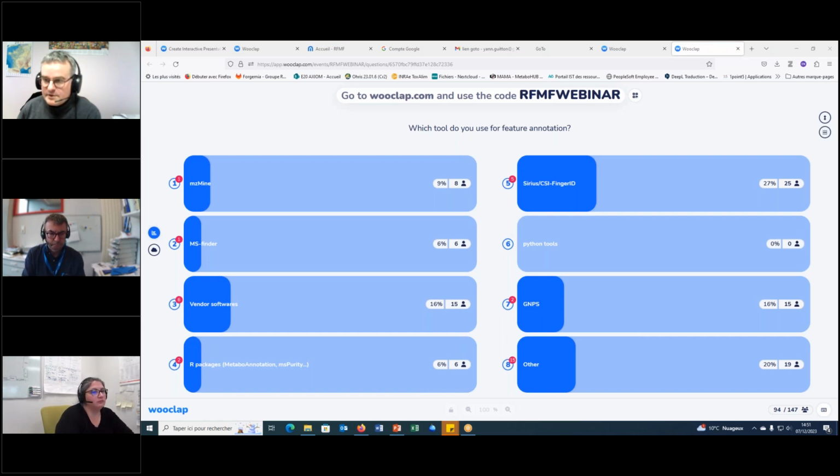So we have MS purity, for example, in R, that is giving a purity score for the isolation of the parent ion, with a score between 0 and 1, 1 meaning that the parent was alone in the isolation window, so alone in the quadrupole before fragmentation, and 0 meaning that we have many ions in that, usually 1 Dalton or 0.7 Dalton isolation window of our quadrupoles. So that's one example.